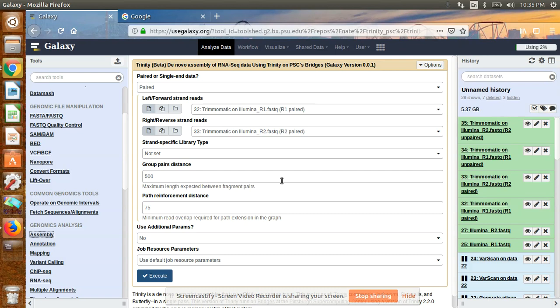We will discuss BLAST2GO later. Today I am going to discuss how to de novo assemble our trimmed raw reads. In the last video I discussed how to check the quality of your raw sequence and how to trim that data. Today I am going to discuss how to de novo assemble our trimmed contigs. Here I will use the software called Trinity.